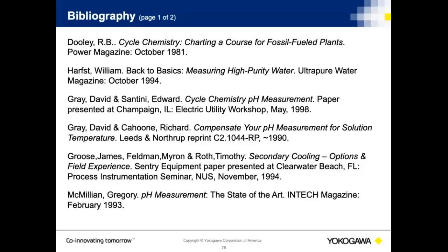So there are extremes you have to look at. Some pH probes in some applications, such as many food applications and fermentation processes, have to go through steam sterilization. So again, it is dictated by the process, not by my recommendations. My recommendations are based on applications I've seen.